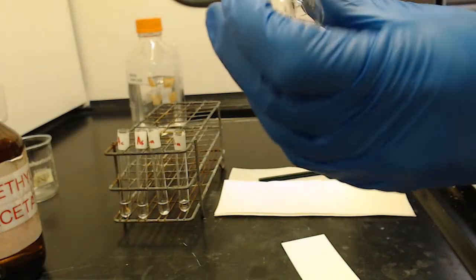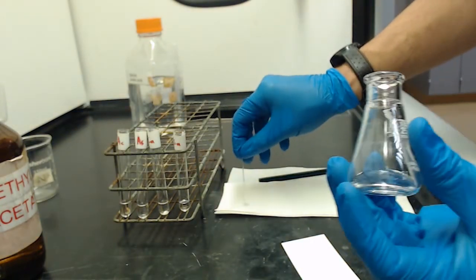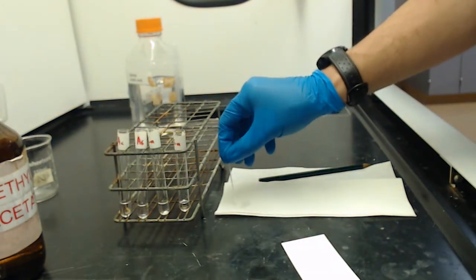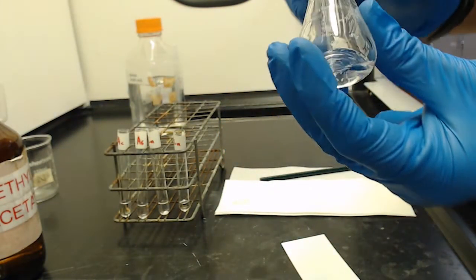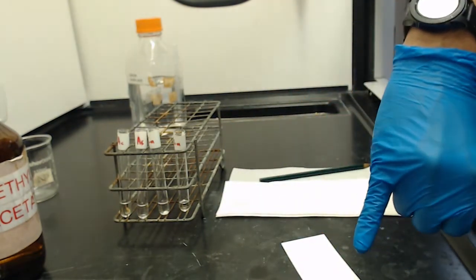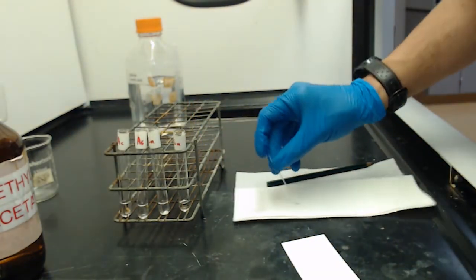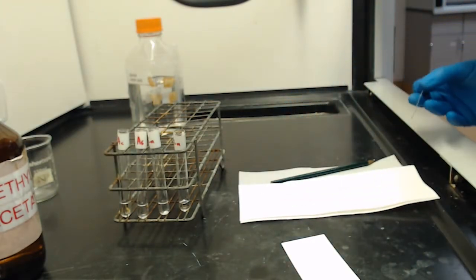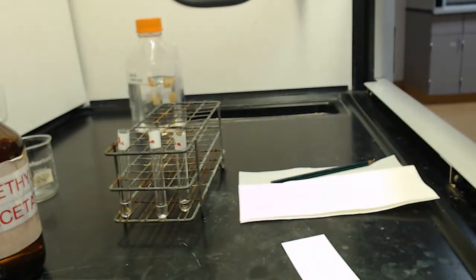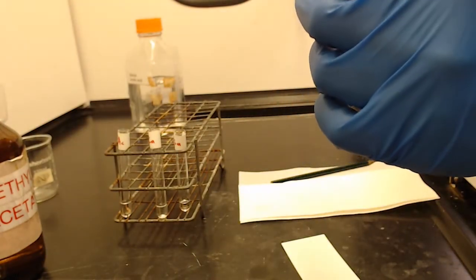Between samples, you want to rinse this out by touching it into your cleaning solvent and then onto a paper towel and let it fully drain onto the paper towel. So draw up, drain, and you want to drain to a new dry spot each time on the paper towel. And while we're doing this, the spot on here is drying. If you're going to be really particular about this, you could use a different capillary tube for each sample. I'm not going to be that particular today. I'm just aware that some cross-contamination may occur, but the size of the spots will make it really obvious which one was supposed to be for that spot.